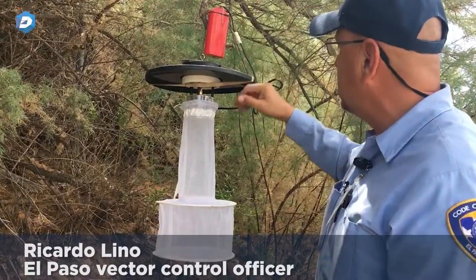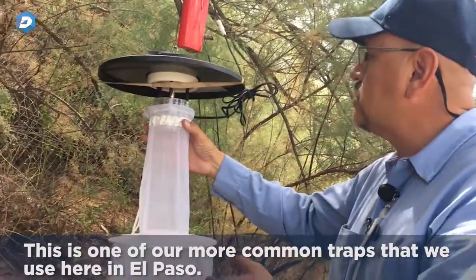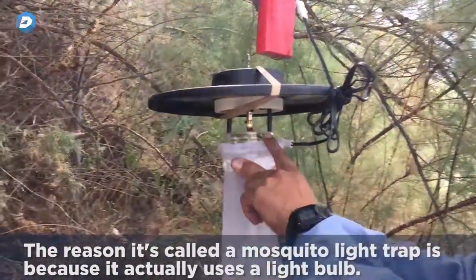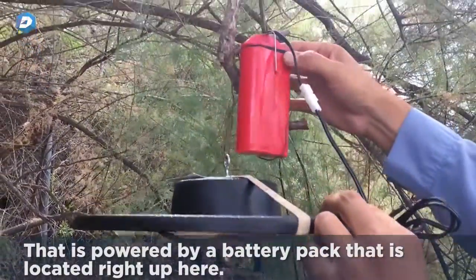What we're looking at here is a mosquito light trap. This is one of our more common traps that we use here in El Paso. It's called a mosquito light trap because it uses a light bulb that is powered by a battery pack located right up here.